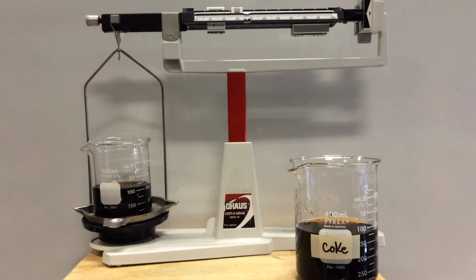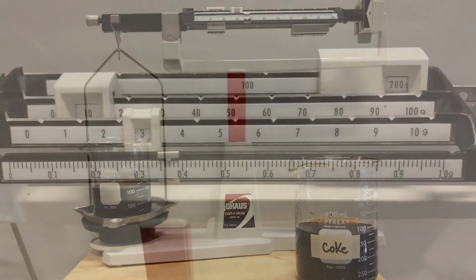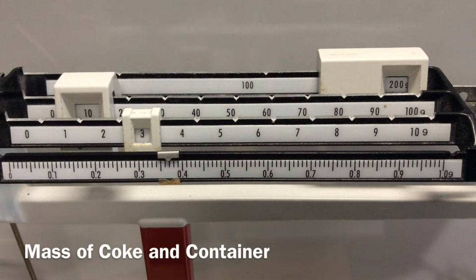Okay, so I have balanced my triple beam balance with the container plus the regular Coke, and now we're going to get up close and personal to read the value. So please make a reading for that value there. That, of course, is the regular Coke and its container. To get the Coke, you can probably guess how to do that.